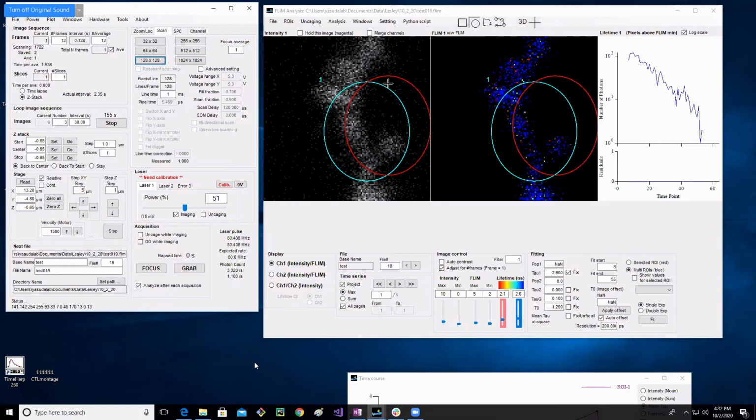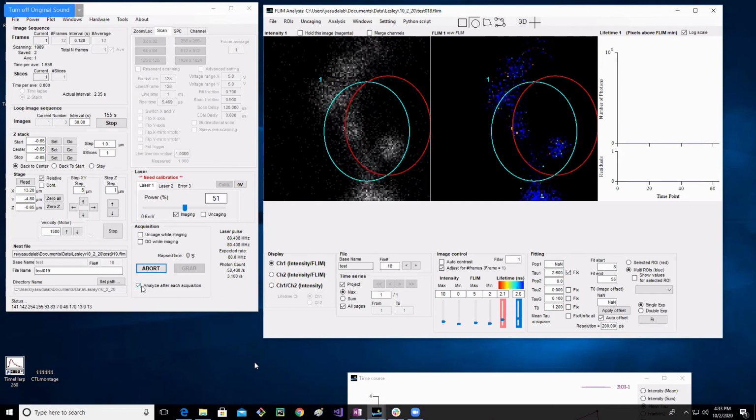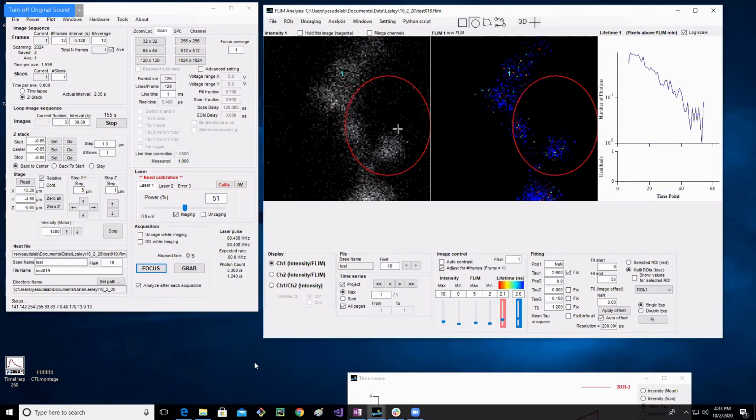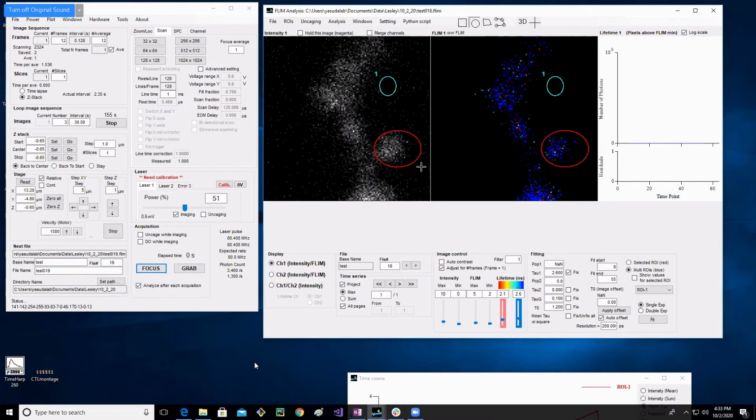But if you think about what we're actually imaging, this spine is about, let's say, 1 micron at the biggest across. Light microscopy has a resolution, depending on the type of light microscopy, of something like 200 nanometers. So we're imaging small structures, and even with really high resolution we're still not going to be able to resolve much within a single spine.